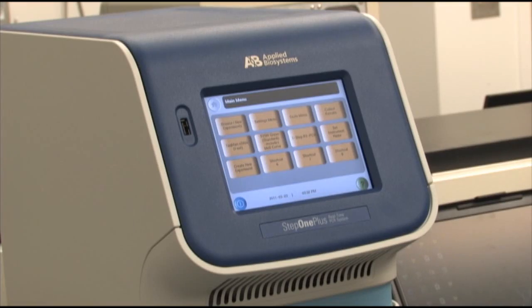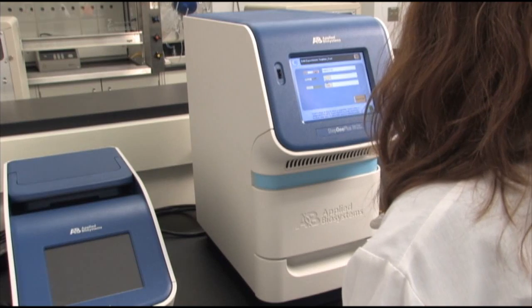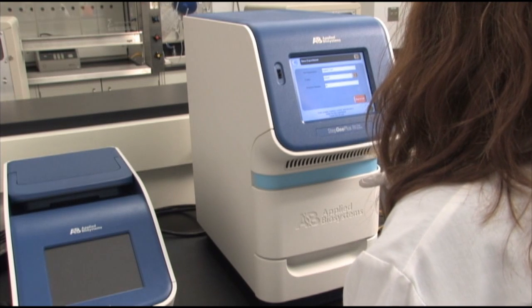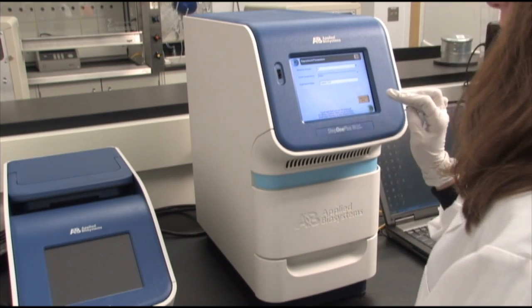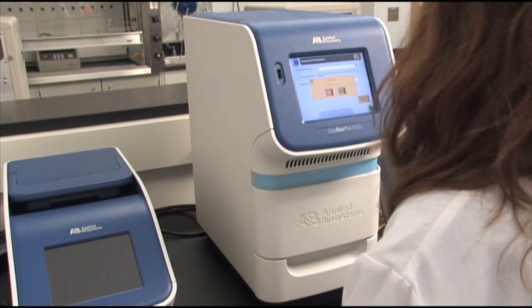Now I'm just going to use the touchscreen function of the StepOne+. I already have the Taqman Fast cDNA protocol right here on the main menu, so I am just going to choose that one and press Save. I saved my experiment. I'm going to start the run now. Say OK.